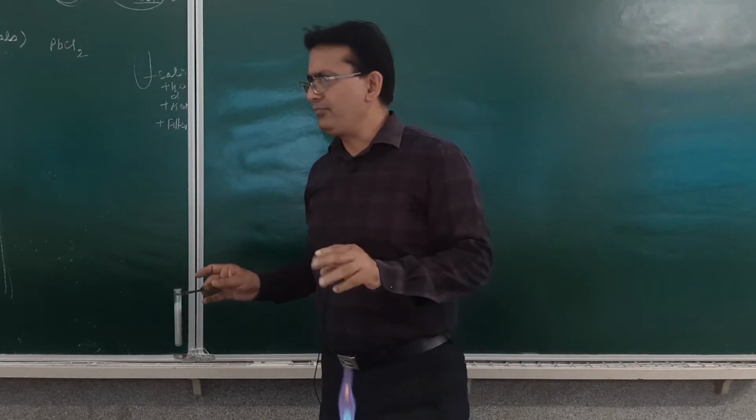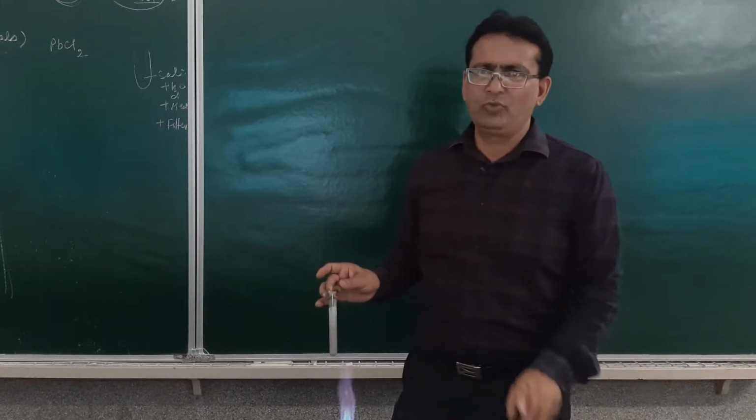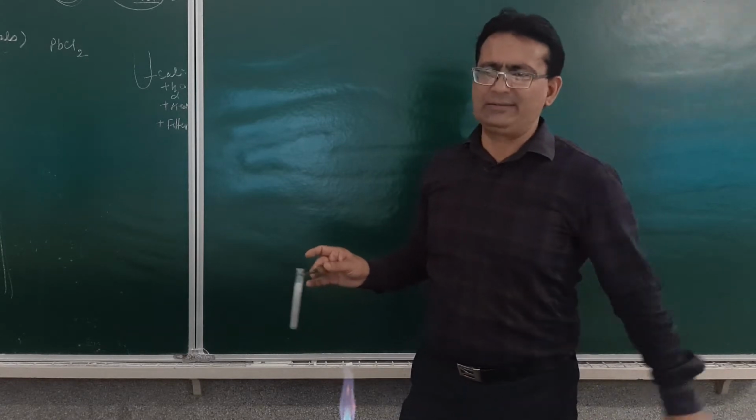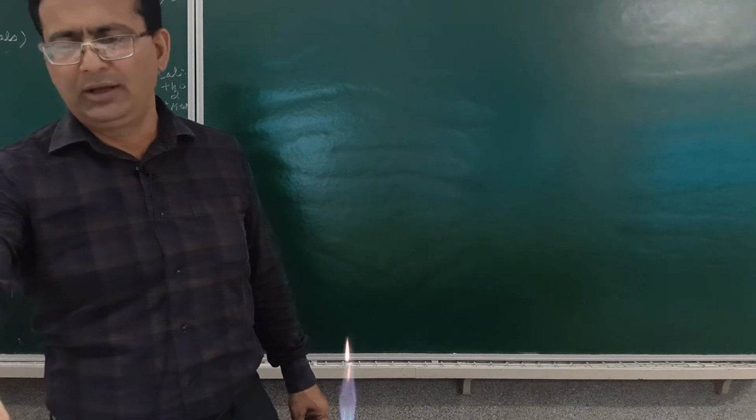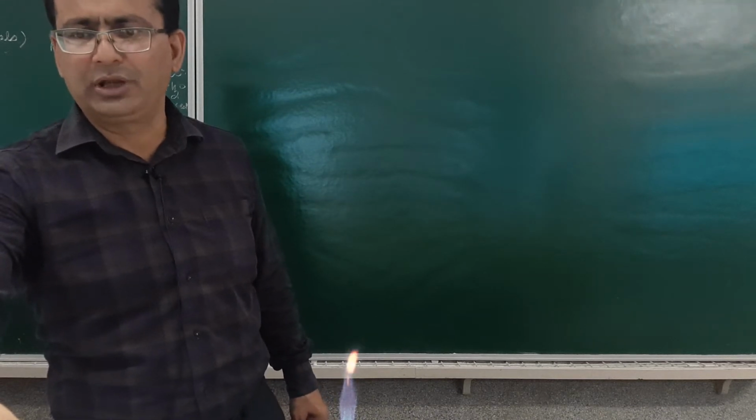Am I clear? If you look at your study material, you will be able to find that this was test number 2 for the identification of the anions, given on page number 2. Getting it clear or not?